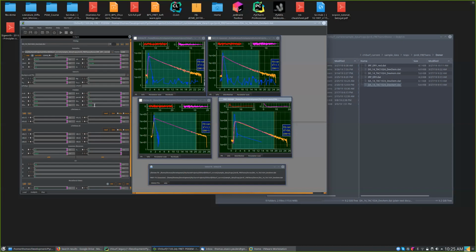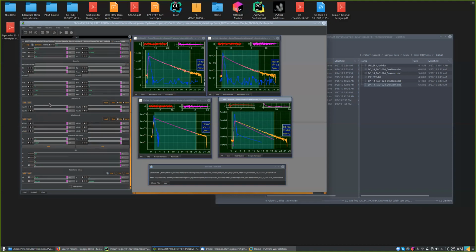Okay, let's pretend we knew them. Like, let's pretend it would be those values, for sake of simplicity. So I guess like there is how much crosstalk from the donor to acceptor is there? 20% or no, 50%. 50%. Yeah, from donor to the acceptor, it should be minimum 50%. Okay, then let's put 50% here as a crosstalk. Okay. Okay, now, like the lifetimes are all connected already.